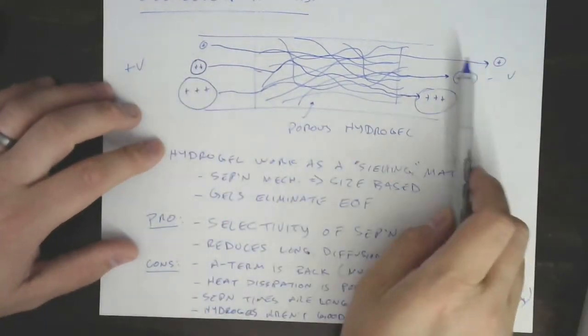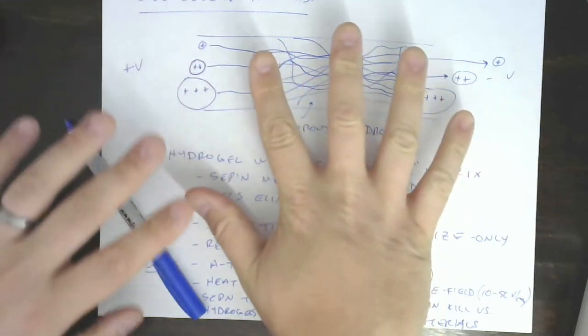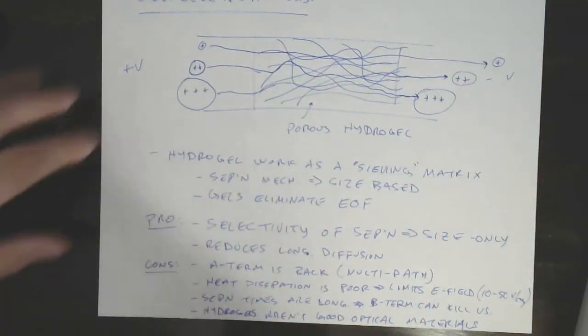These are often done offline, with dyes, for example, to see your sample after it's separated. So instead of waiting at the end and seeing stuff fall off, usually what you'll do is you'll get a separation in space on this gel, and then you'll image that separation in space. Let's talk about that very briefly here.